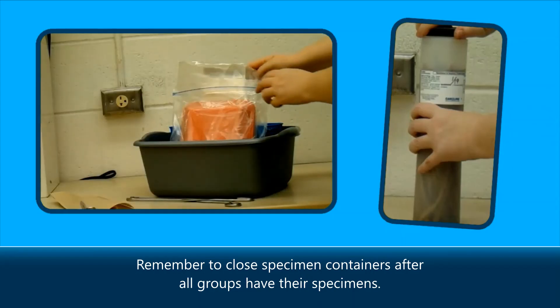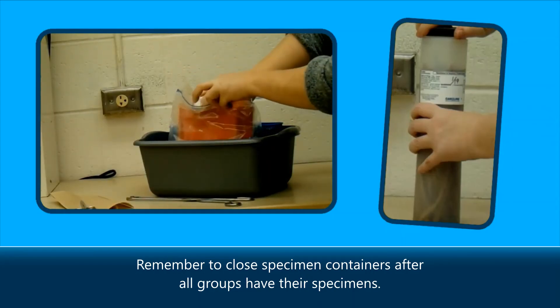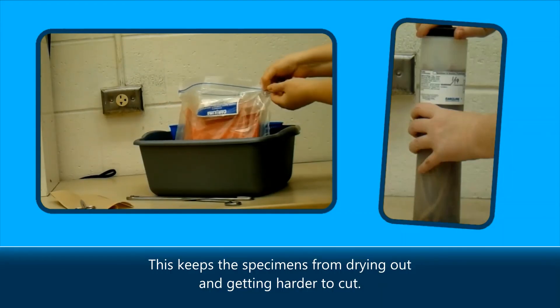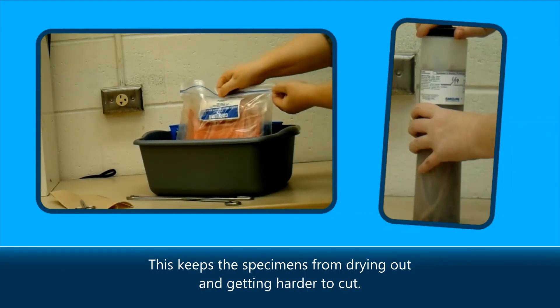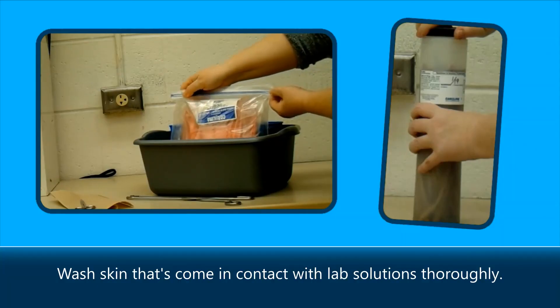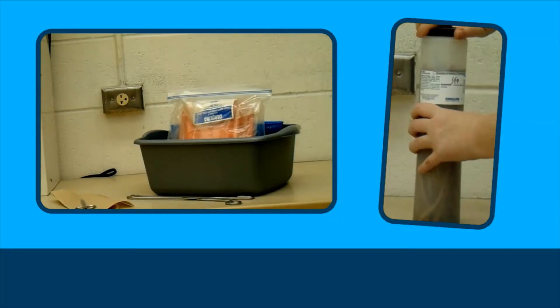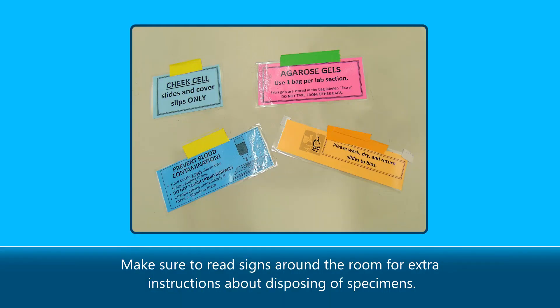Remember to close specimen containers after all groups have their specimens. This keeps the specimens from drying out and getting harder to cut. Wash skin that's come in contact with lab solutions thoroughly. Make sure to read signs around the room for extra instructions about disposing of specimens.